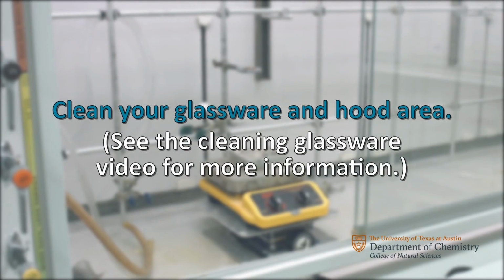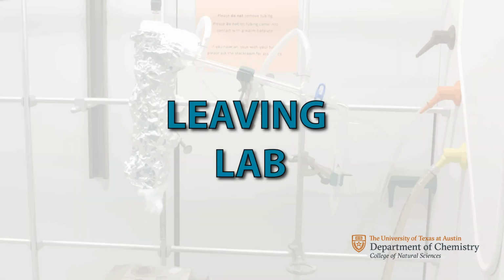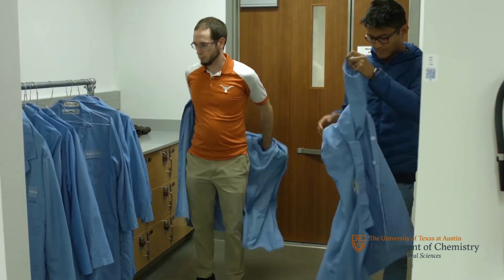To finish up, clean your glassware as well as your hood area. For proper instructions on this, watch the cleaning glassware video. When you are ready to leave, return your goggles to the goggle cabinet and your lab coat to the rack.